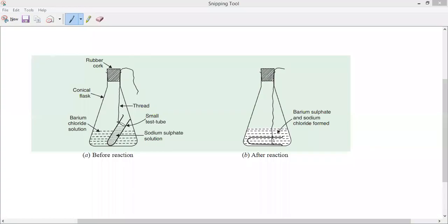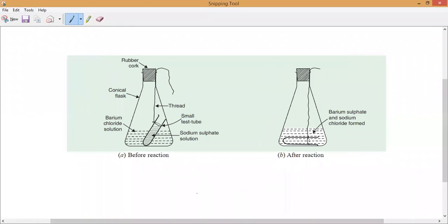Law of conservation of mass. I think you might have noticed in our NCERT chapter 3 a similar figure in our book. Yes or no? Now all of you observe very carefully. To verify the law of conservation of mass, I need to take some chemicals and perform a chemical reaction. So let us discuss what this experiment is.